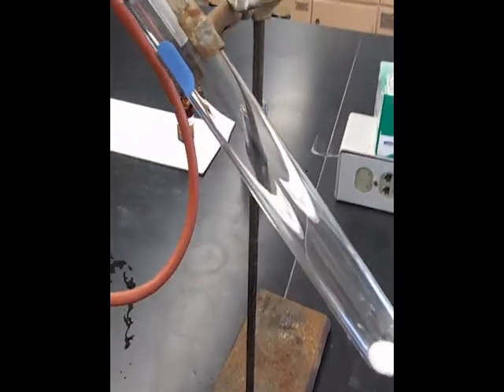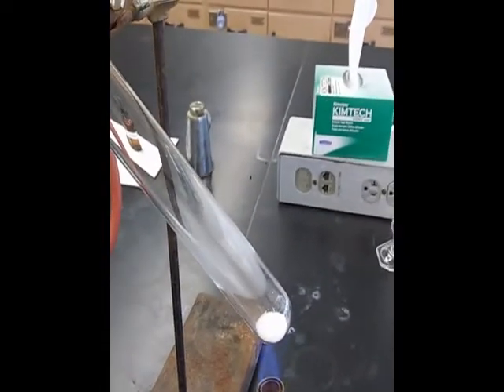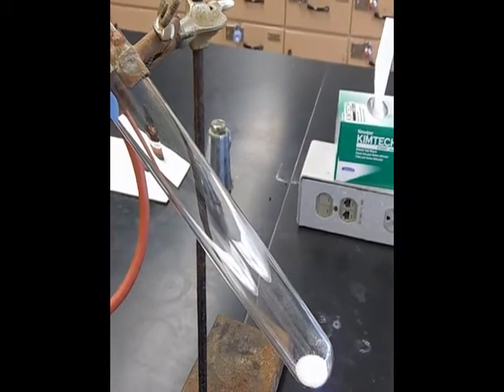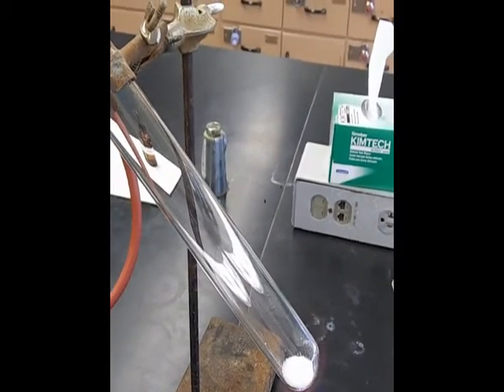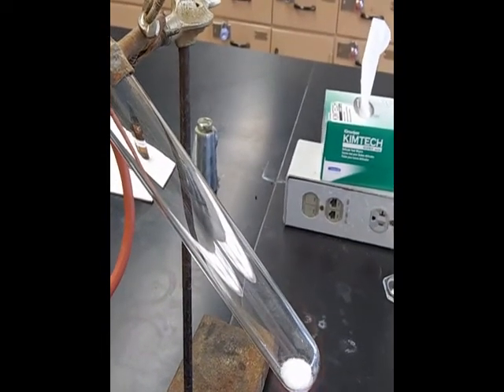All right, so I've got the Bunsen burner lit. I'm just going to start heating this up, and you'll see as we go here, and I've got to be really careful not to overdo it, but you're going to see it's going to start to melt. Hopefully you can see that there. You can see it melting a little bit.